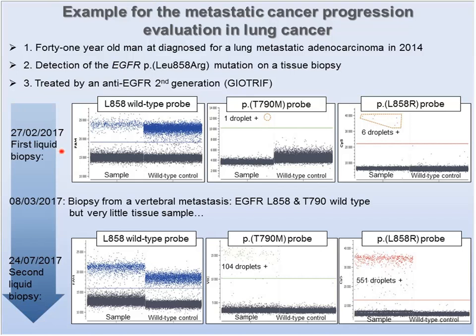We first analyzed a liquid biopsy in February 2017. In this liquid biopsy, we detected the initial activating mutation. So you have here the blue channel corresponding to the wild type probe, the green channel corresponding to the resistant mutation, and the red channel corresponding to the activating mutation.